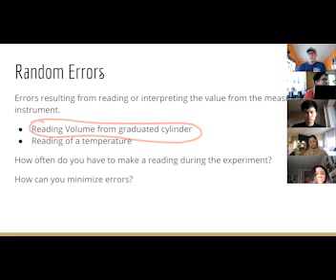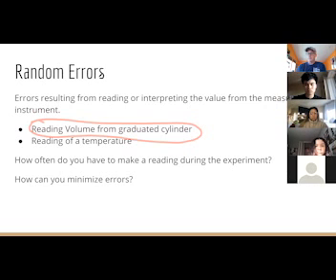The surface. What about the surface? Like having it on a flat surface. There you go. Yeah, exactly. If I have it tilted at an angle, it's going to be very difficult to get an accurate reading. So that's one thing. Level surface, I like that one. So what's another one you can do? What's something else we can do to make it as accurate as we can?